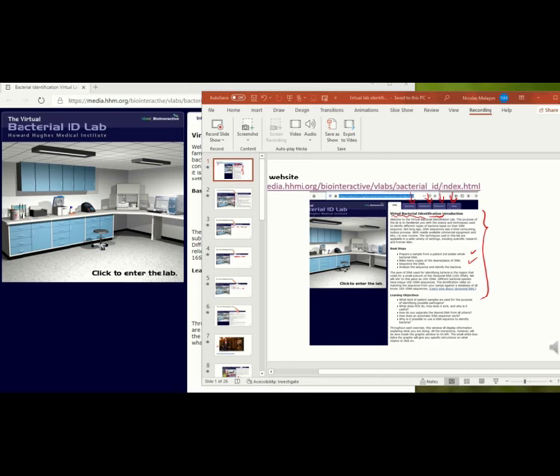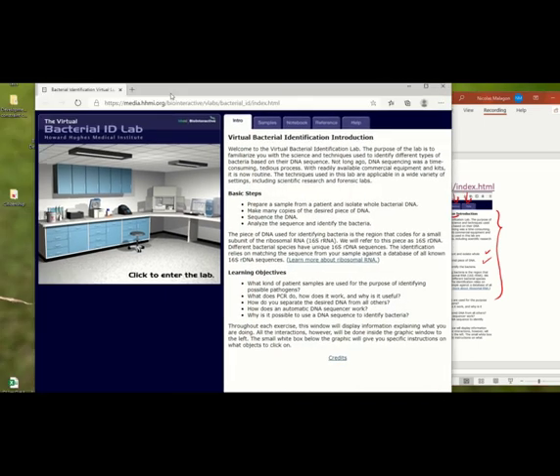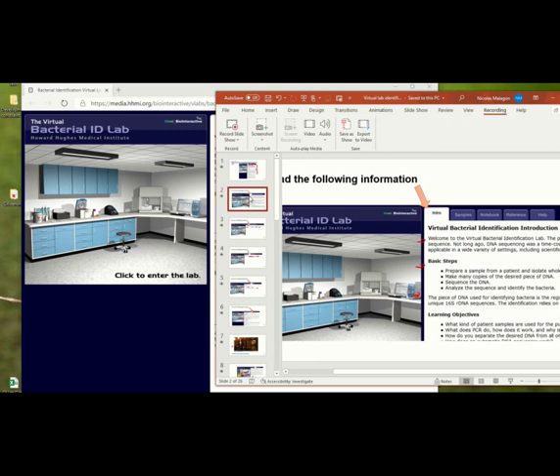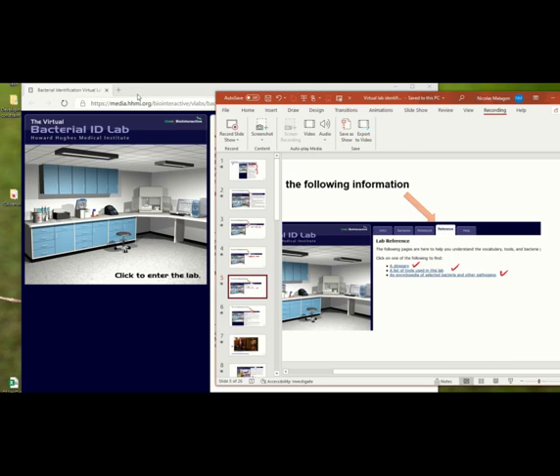So in the beginning, you just have to click here, or you can copy this and you will go to this website. And as I said here, you just go and look into the different tabs. So let's go together and do that.